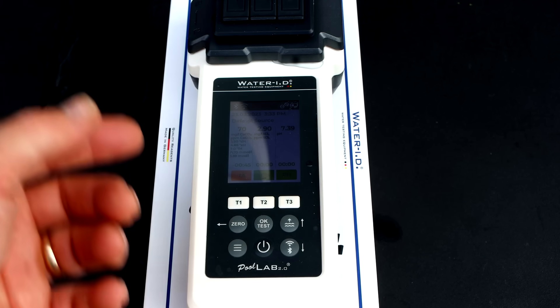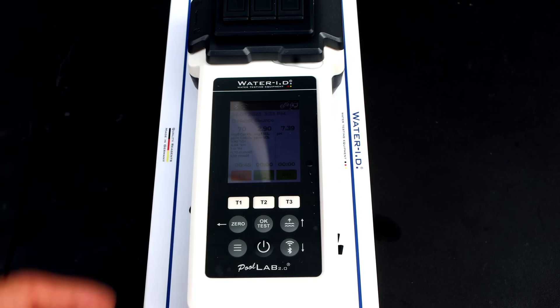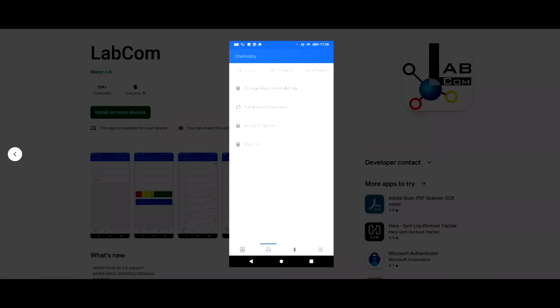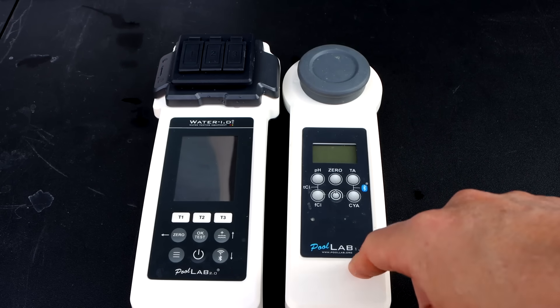The Pool Lab 2.0, or Water Tester in the US market, has a really nice 2.4-inch color LED display and is engineered in Germany. You can also send the results through the cloud via the LabCom app on your mobile device or tablet. It's a great way to store readings, and the LabCom app will also give you recommendations.